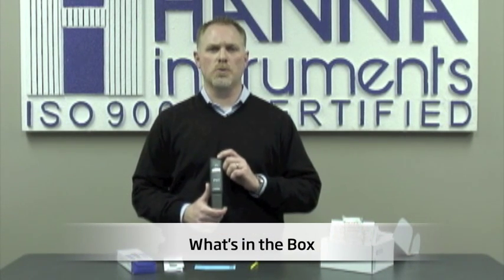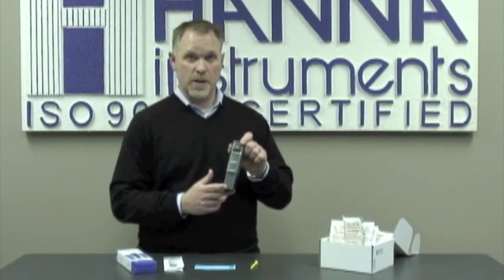I'd like to show you what you'll find in the box when you receive your unit. We have the tester, a calibration screwdriver, calibration certificate, and an instruction manual.